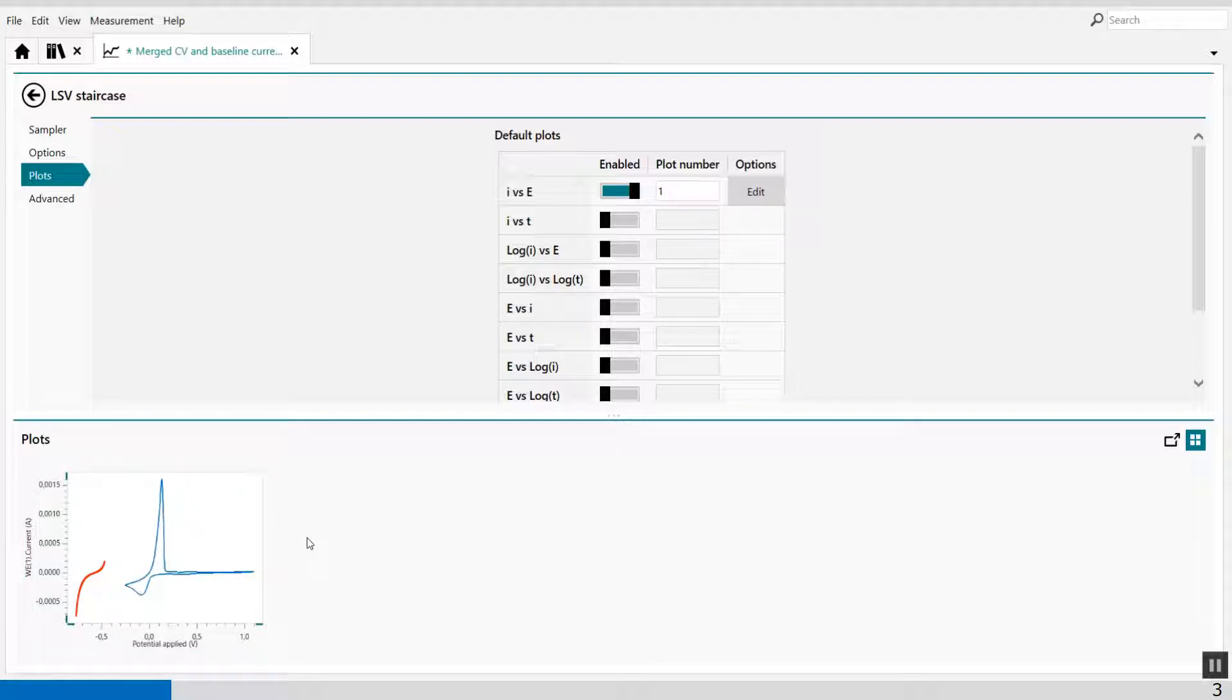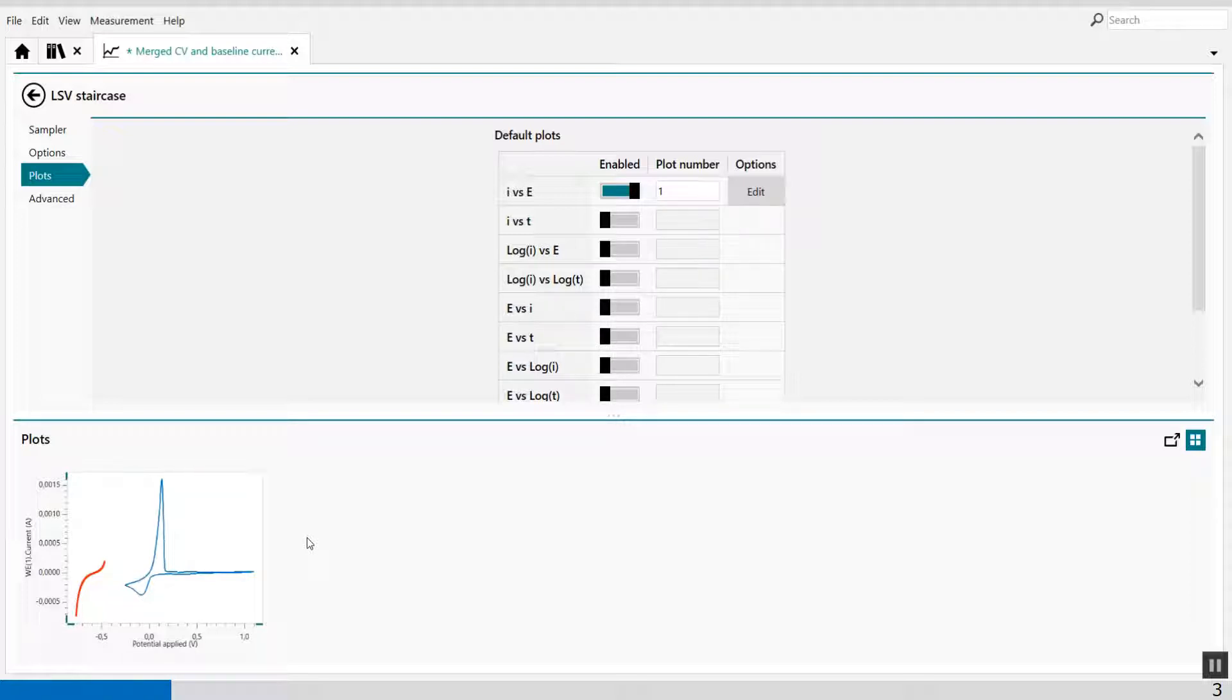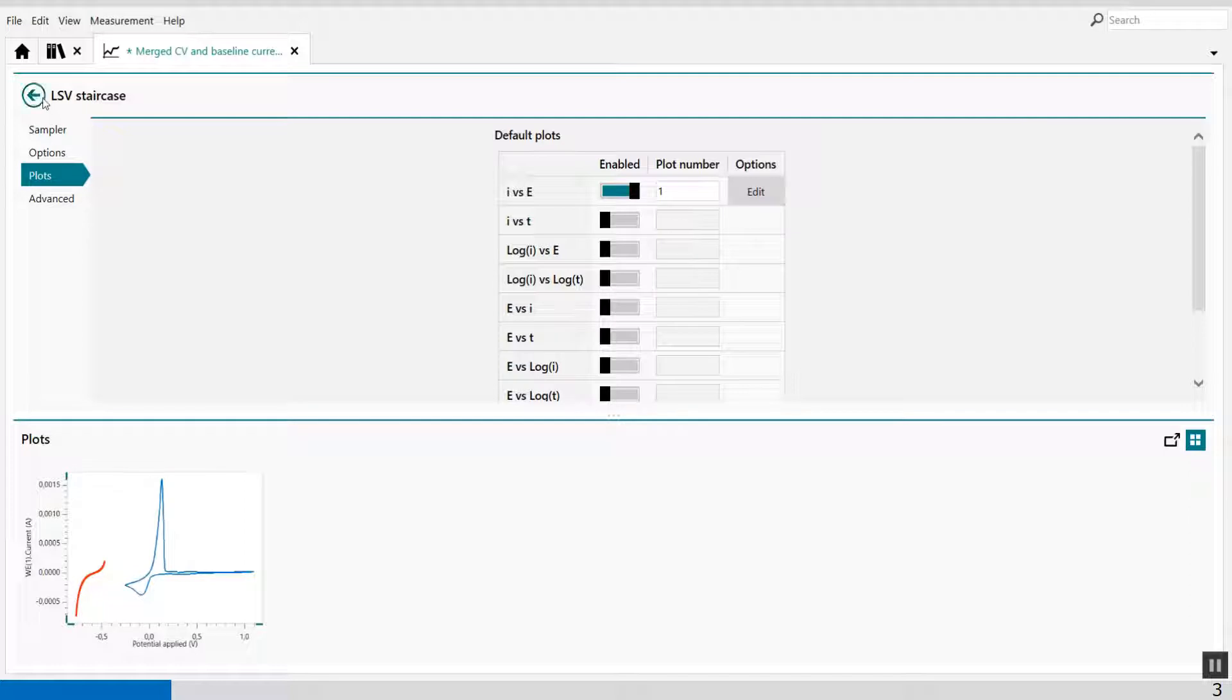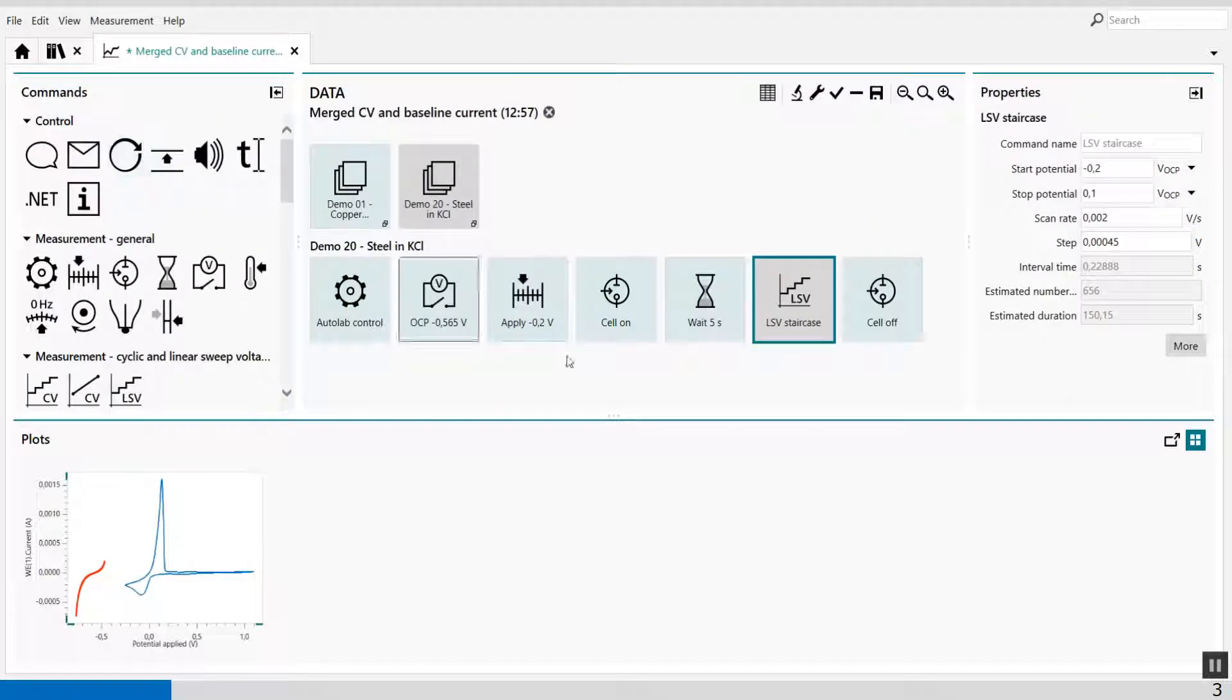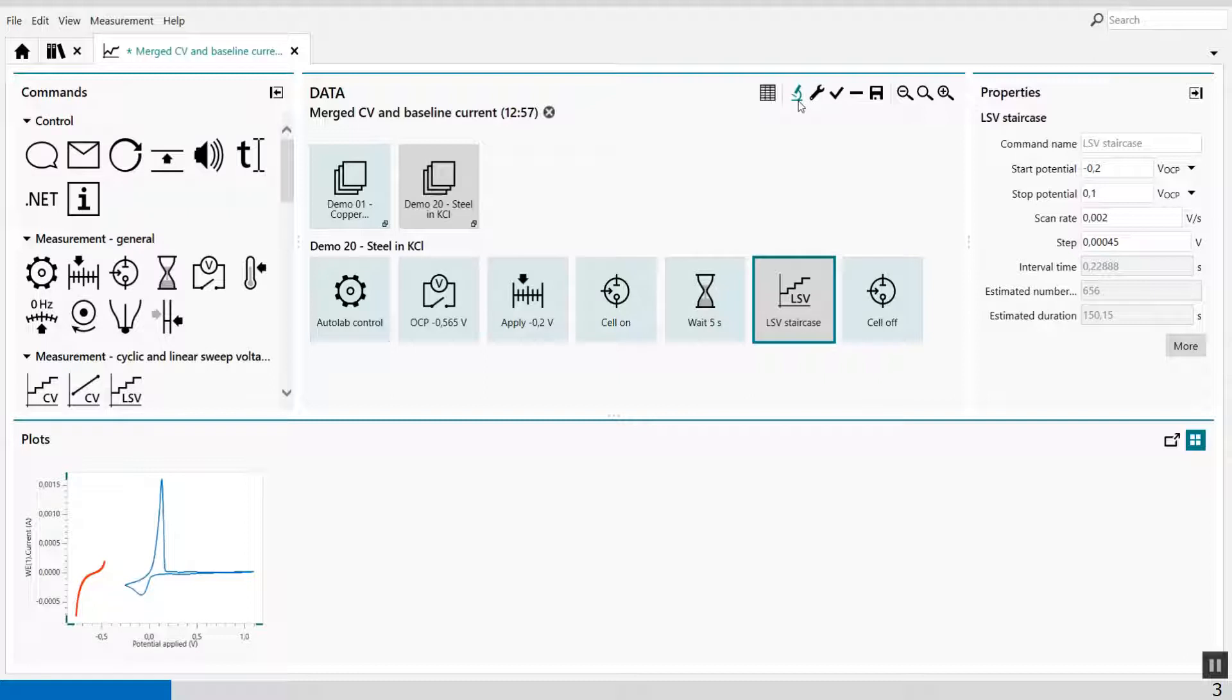The next thing I have to do, I have to subtract the currents from the LSV. Well, first the average current of the LSV from the current of the CV. Well, first I have to calculate the average current of the LSV. This is done by using a calculator.